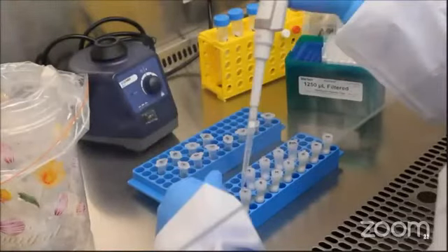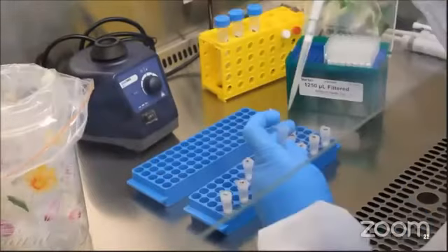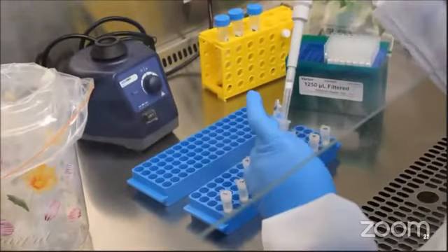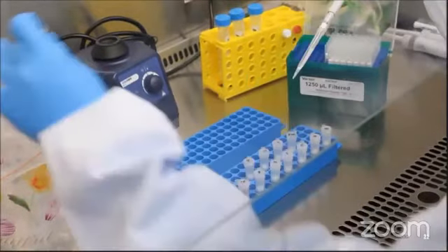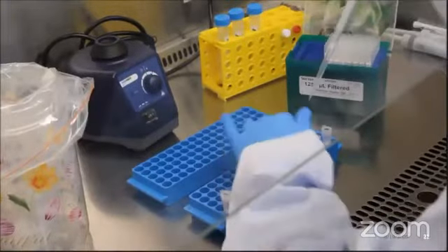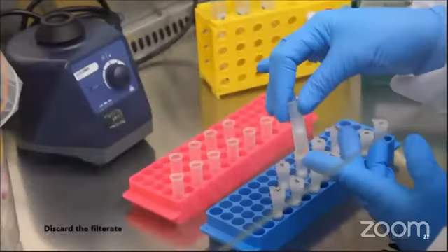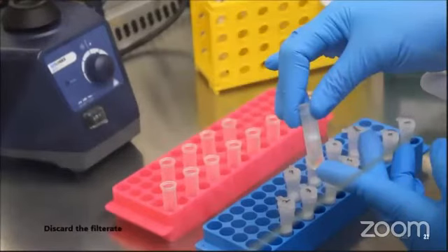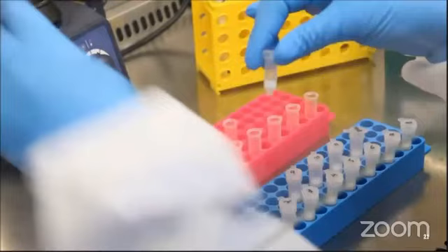The remaining volume is added on the column and again centrifuged at 8000 rpm for 1 minute. Now discard the filtrate, repeat the same procedure, and place the column into a fresh collection tube.